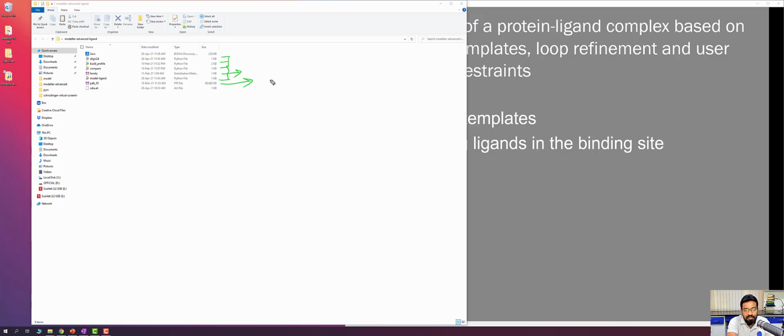This file contains the amino acid sequences of all the protein molecules which are already deposited in the Protein Data Bank. And this is the target sequence. I told you that I already downloaded the target sequence. I prepared the target sequence in the ALI file format, and I saved that file as sdia.ali. So that is the target sequence.